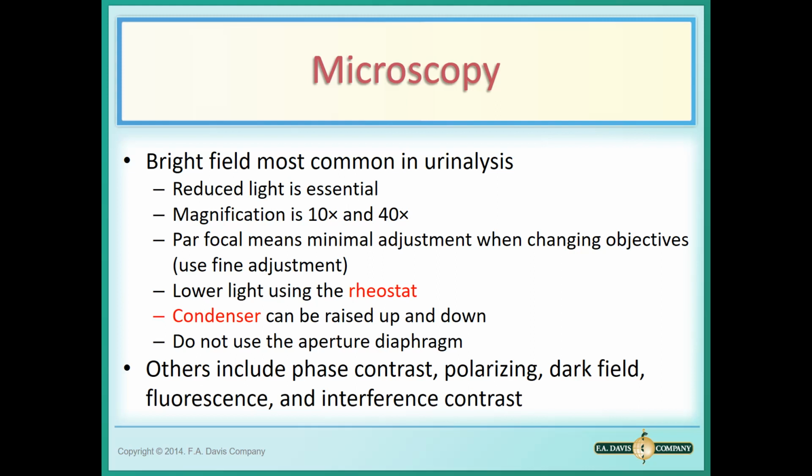So you get much more contrast because the light source affects the object in different ways and projects differently against it based on the thickness in different parts. So when you have a 3D object, obviously the light reflects it in different ways and provides a nice contrast for us to be able to view each object.